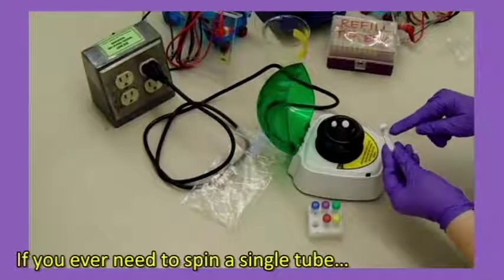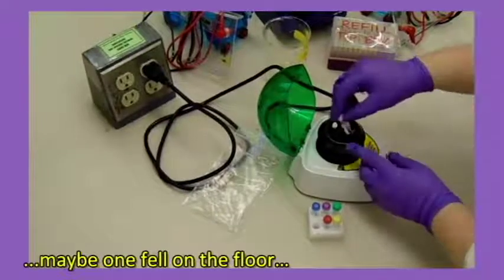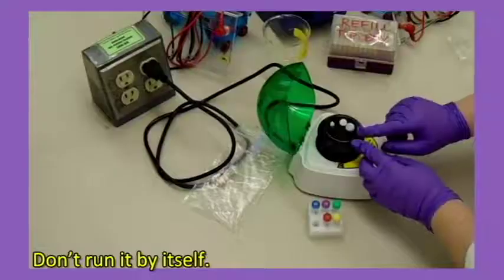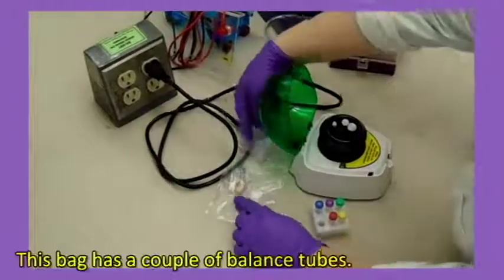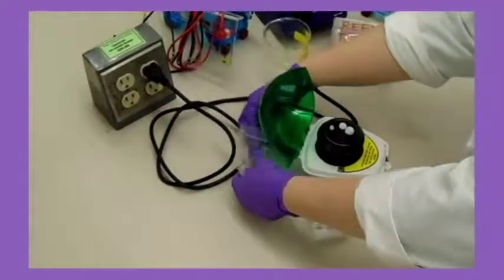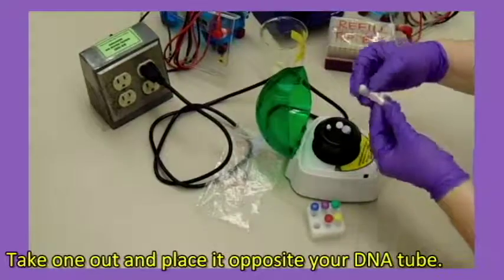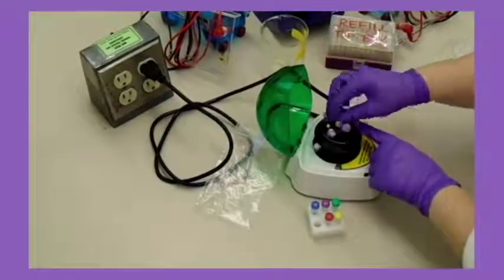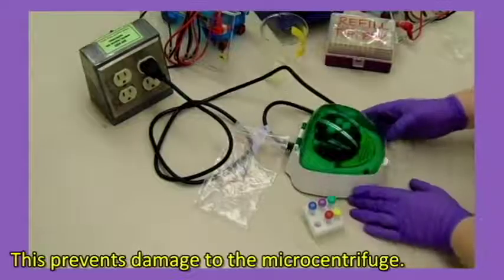If you ever need to spin a single tube, maybe one fell on the floor, don't run it by itself. This bag has a couple of balance tubes. Take one out and place it opposite your DNA tube. This prevents damage to the microcentrifuge.